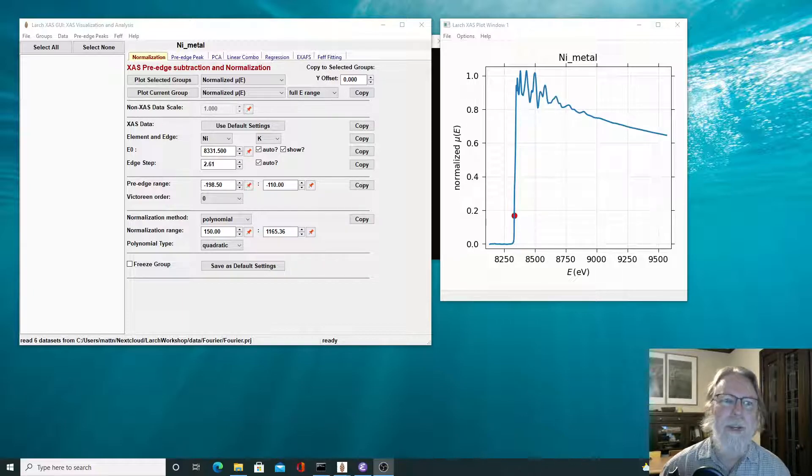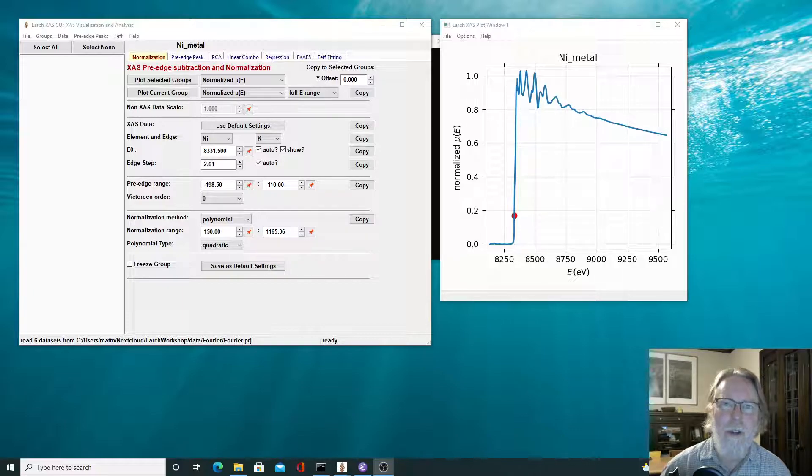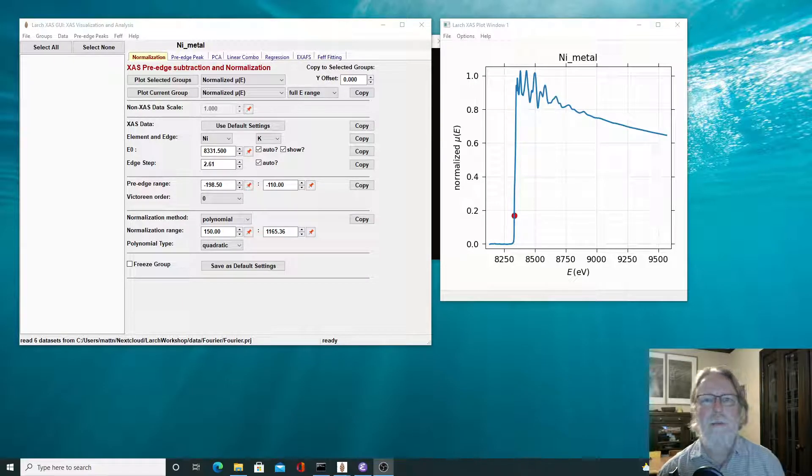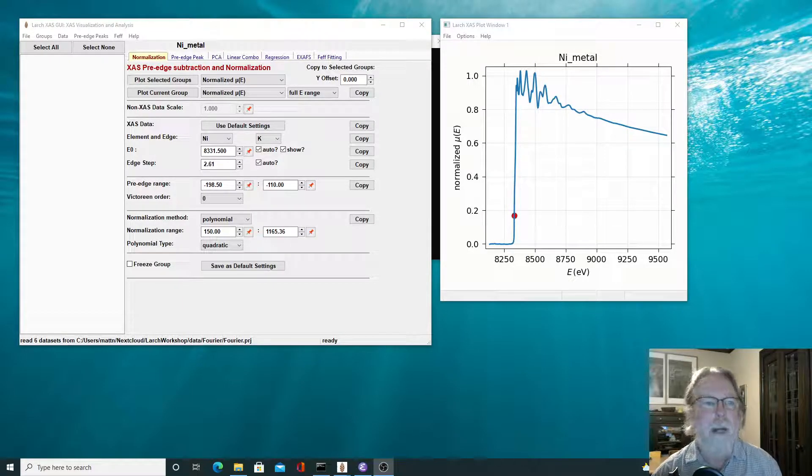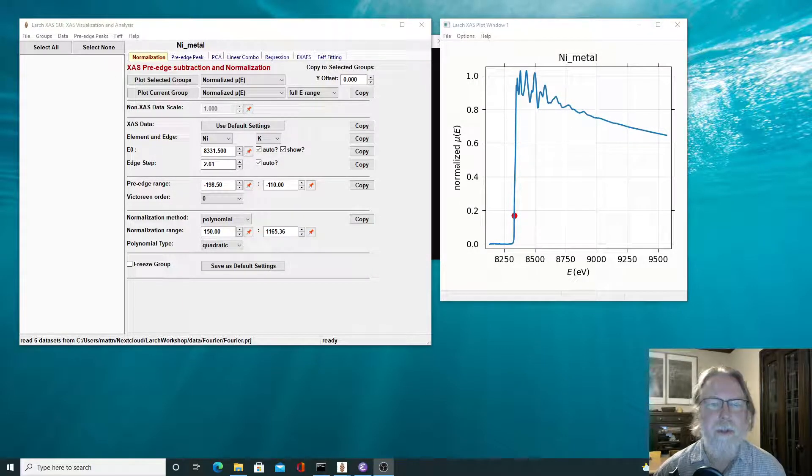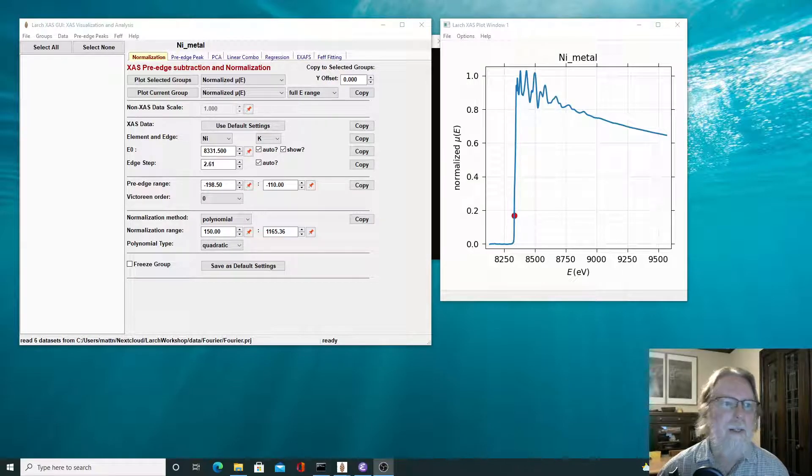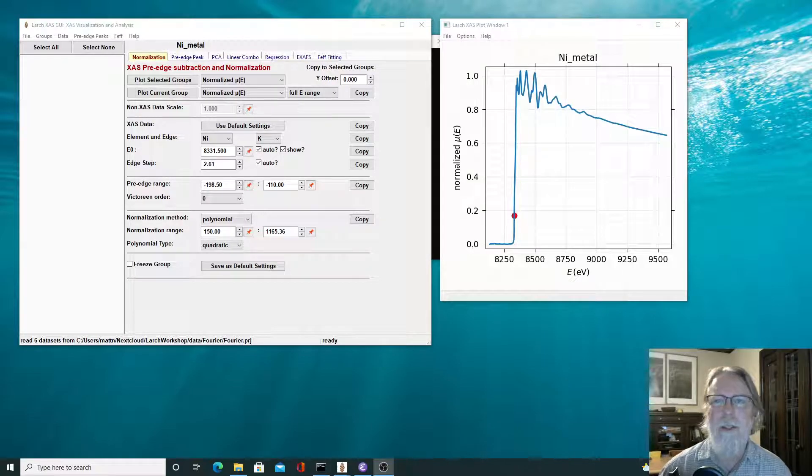Hi, I'm Matt Neuville, and this is part of the video series on using LARCH for XAFS analysis. Background subtraction is often viewed as a complex and even error-prone process, but I hope to show you that it does not need to be this way.